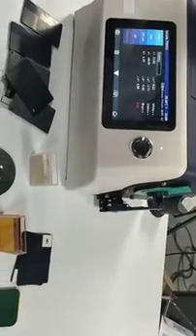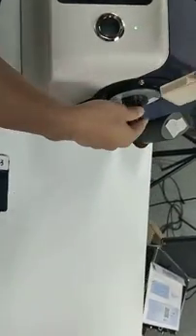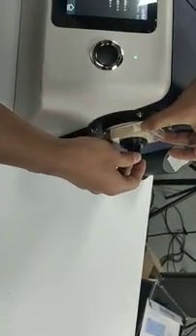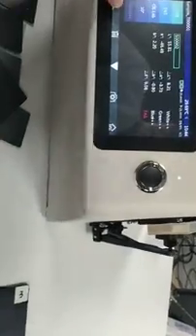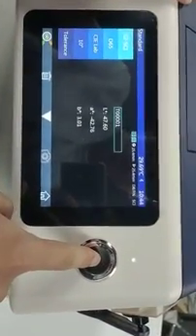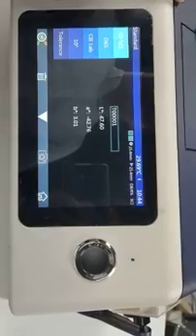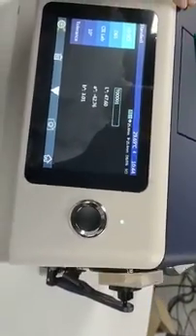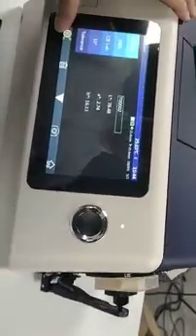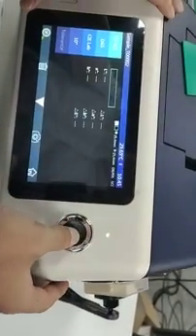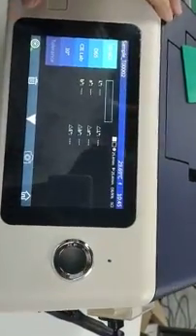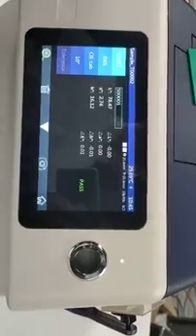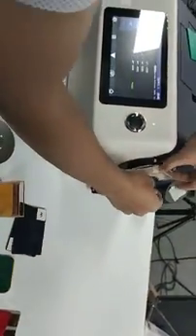And we can also, here we can also use it to measure the powders here. You can see powder. Put it here. Put it here. Standard measurement. Ok.